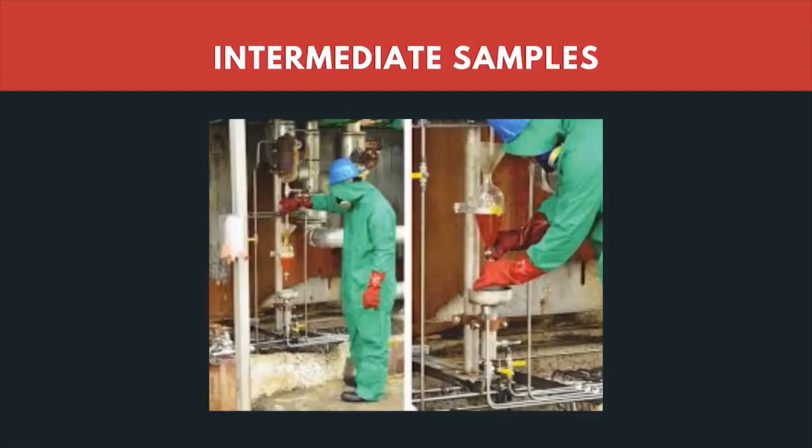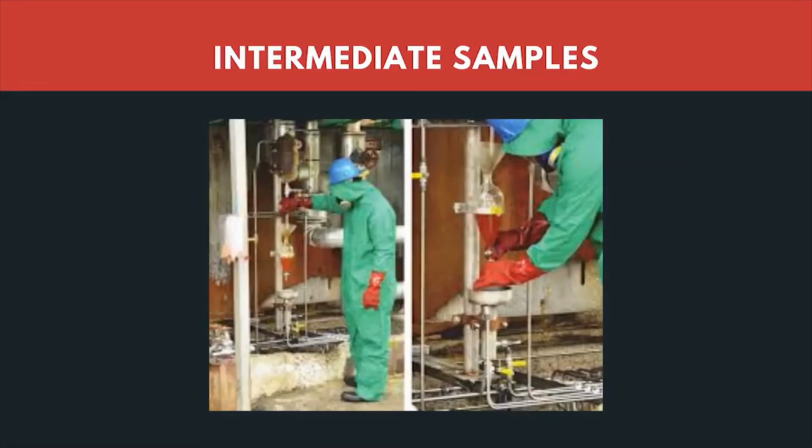So, as we have seen, whenever a tank is full, we send a sample for the complete analysis, and if the complete analysis is okay, then that particular batch is pumped out to the end customer. But in case it is off-spec, then it is going to be a surprise, and it is going to result in so much time in reblending or reprocessing. How can this be avoided?